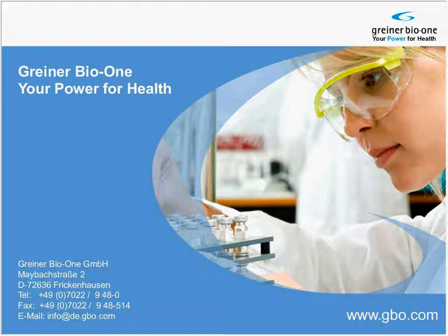We have another question here. With the CV of inter- and intra-plates that you had mentioned being somewhere between 5 and 10%, what kind of CV may one expect of the full product one may either produce in-house or in commercial products? This really depends on the detection method.